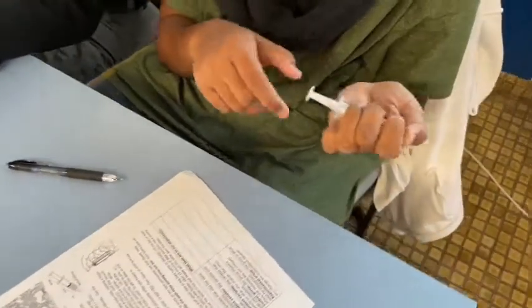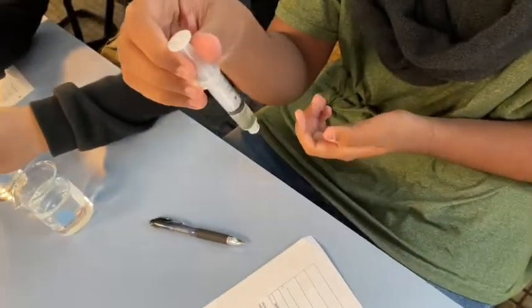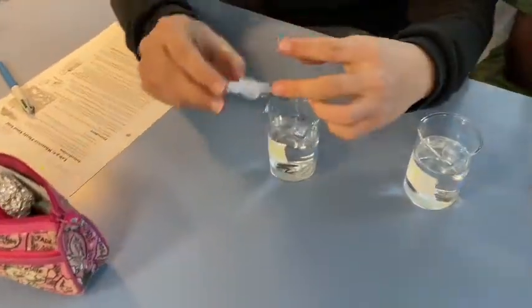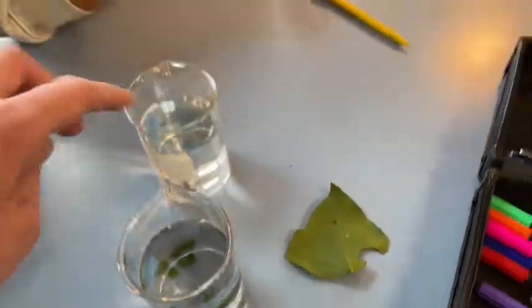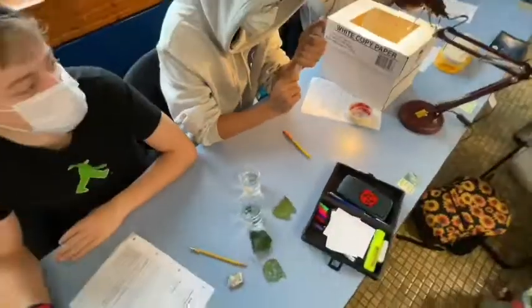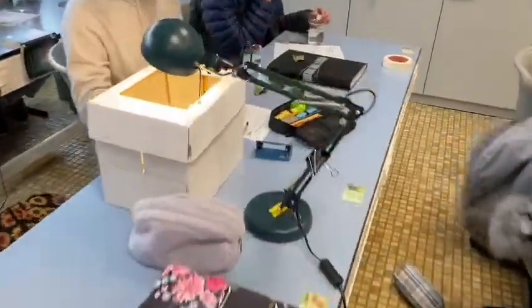All right, are they sinking to the bottom there, Ken? Yeah. Okay. A lot of mine are sinking, but a few of them are still up top. Okay. All right. Good. So you got them in. So you're going to repeat the one for that. Position the lamp so that you can look in without having to move it.